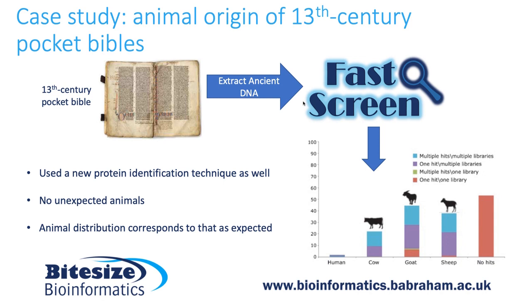The team went out to investigate the sources of the vellum used in these Bibles. Foremost, they used a mass spectrometry technique to do this. However, they also devised a technique where they extracted ancient DNA from the vellum, sequenced it, and then were able to process it with FastQ Screen. By the end of their analyses, they concluded that there were no novel and unusual animals' hides used in the construction of the vellum. As I mentioned, certain animals such as squirrels were put forward as possible candidates for the reason it was suddenly possible to generate these ultra-thin pages.